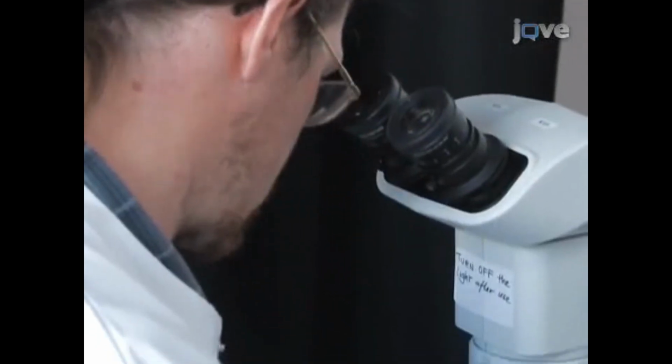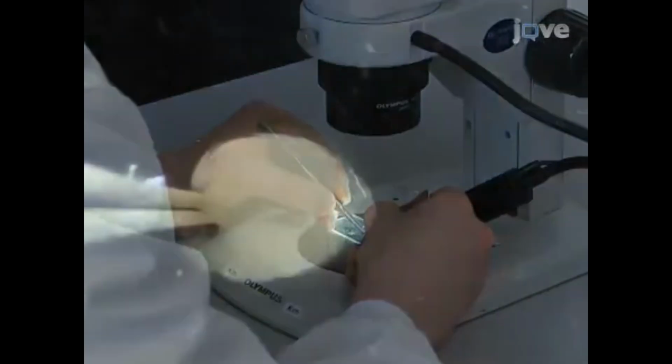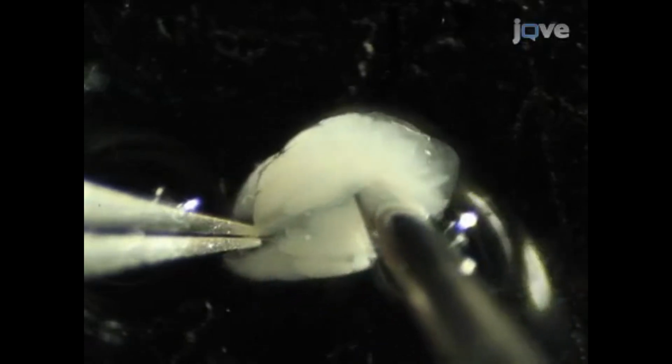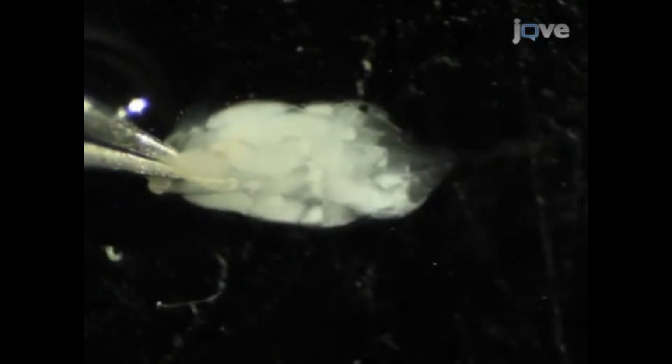To isolate late-stage egg chambers, a different method is required. With the posterior of the ovary grasped, as described earlier, introduce the dissecting probe into the posterior end of the ovary near the forceps. To avoid puncturing the egg chambers, insert the probe between late-stage egg chambers. Pull the dissecting needle through the ovary until it exits at the early-stage egg chambers. When done correctly, the probe will remove the connective tissue holding the ovarioles and late-stage egg chambers in place.